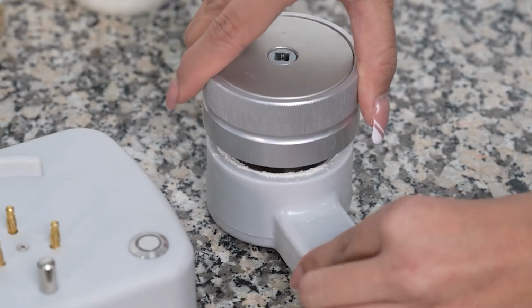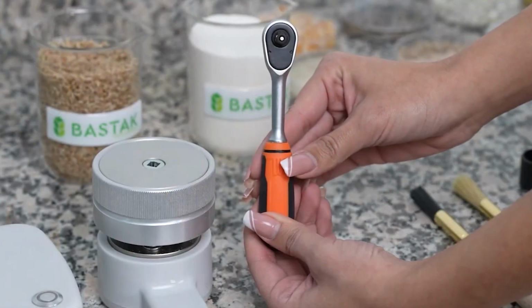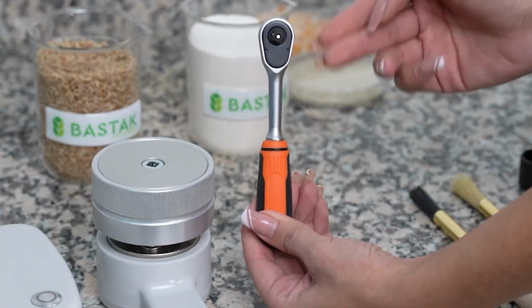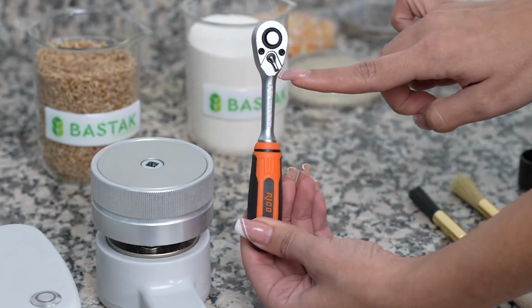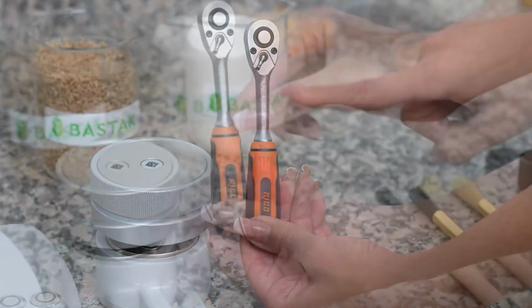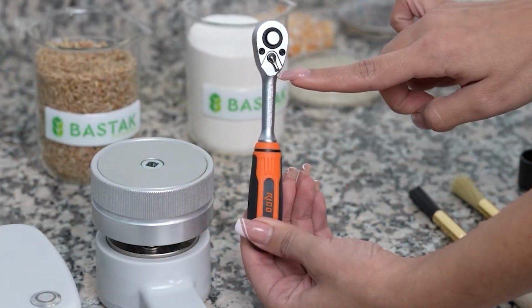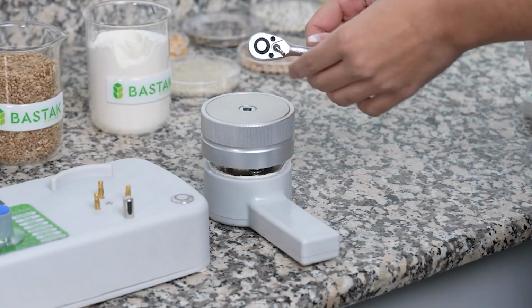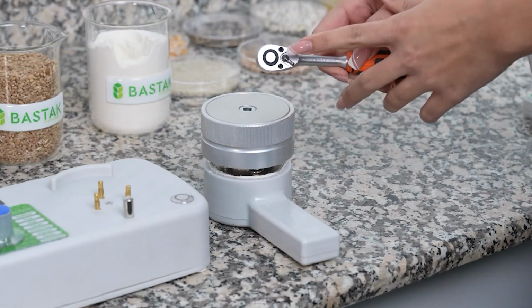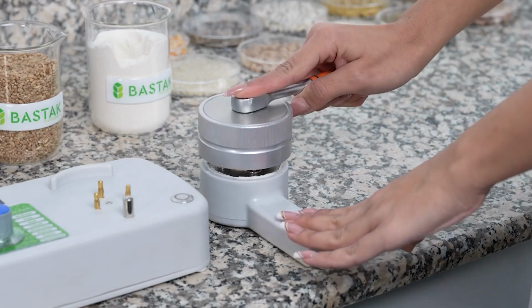Additional tightening and loosening require the use of the tightening/loosening tool. The tightening/loosening tool has a square protrusion at the front and a claw at the back that allows bidirectional movement. When the claw is pulled to the left, it performs the tightening operation, and when pulled to the right, it performs the loosening operation. To insert the tool into the crushing unit slot, the round button on the tool must be pressed, otherwise, the tool won't fit into the slot, and the tightening process won't occur.